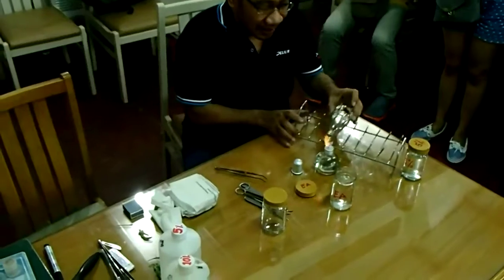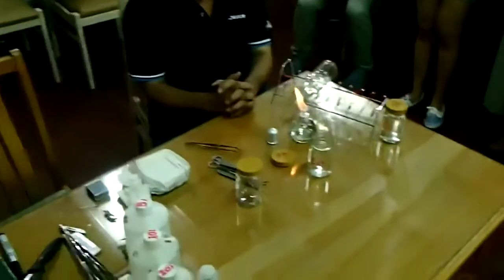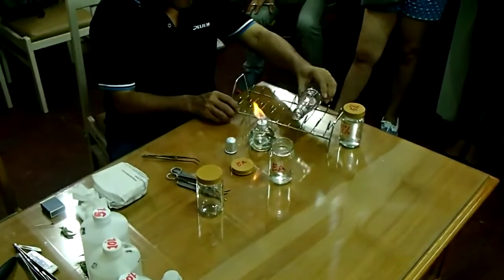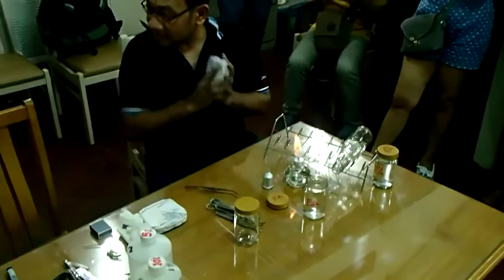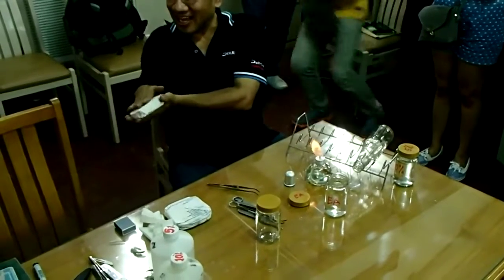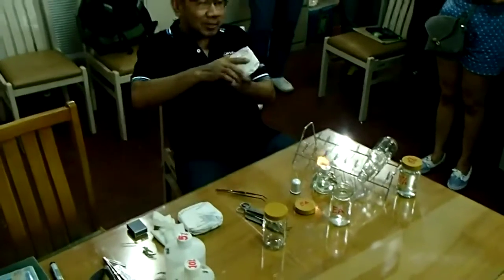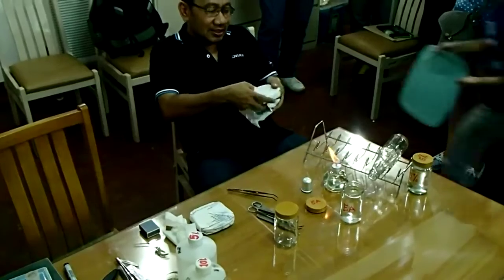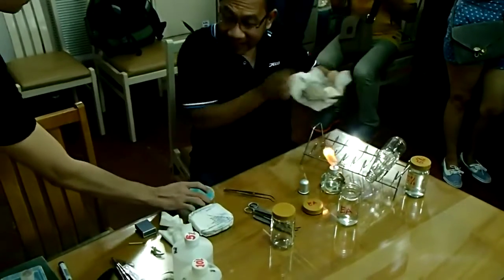Some prefer to face the flame directly — they say it's more sure. That's their own preference. When you open your petri dish, make sure the lid is on top. When you open it, don't leave it open for too long. If you don't need it open, close it right away.